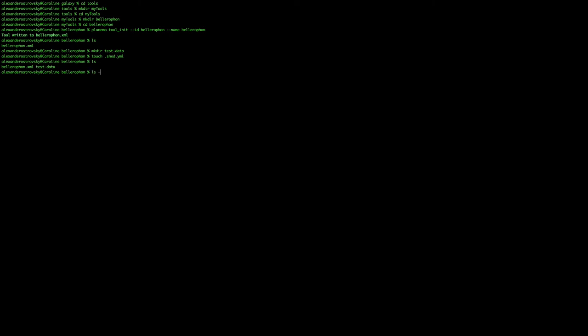Let's take a look at the structure of our tool directory. And then we can open up the tool skeleton itself and let's see what PlonimoToolInit created.